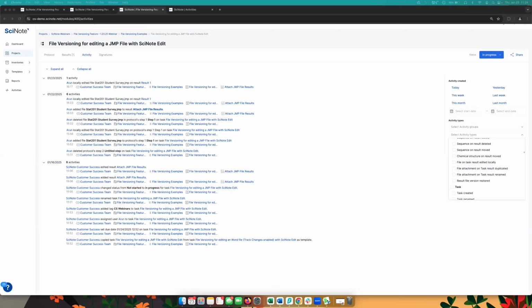Thanks, Nate. Yeah, I'm going to share my screen just to go over another example, if you will. So this isn't necessarily a new feature, but an existing one that we think works well in conjunction with the file versioning as well as the audit trail. So let's imagine the hypothetical scenario where you're going back to revisit some of your data and you notice that something was modified in a result file, but you're not sure when this change was made or who made it. And you want to dive into the audit trail to sort of track when that happened.